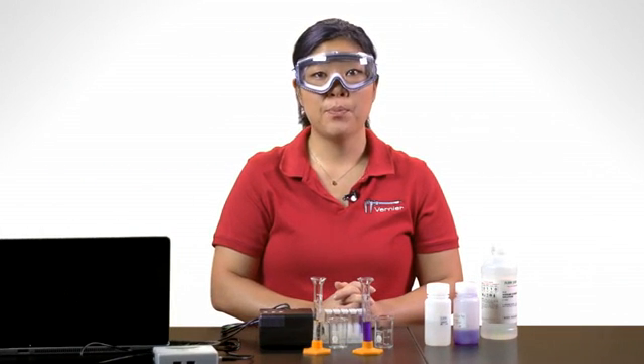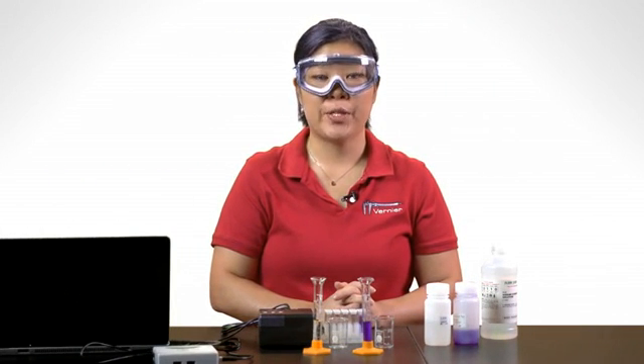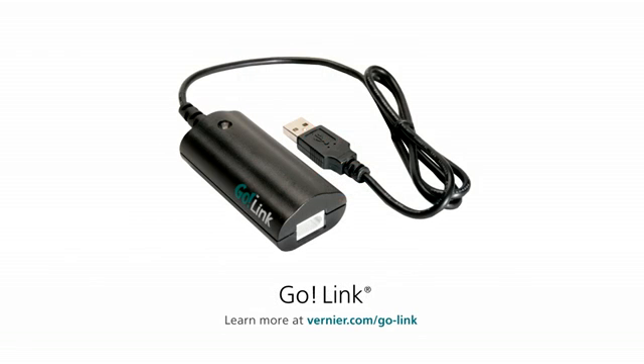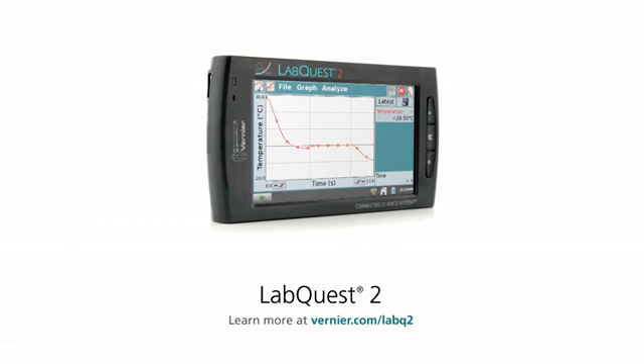To use a colorimeter with a computer, you will connect the colorimeter to an interface and then connect the interface to your computer. I will use a LabQuest Mini as the interface in this case, but you can also use a GoLink, a LabPro, or even a LabQuest as the interface.